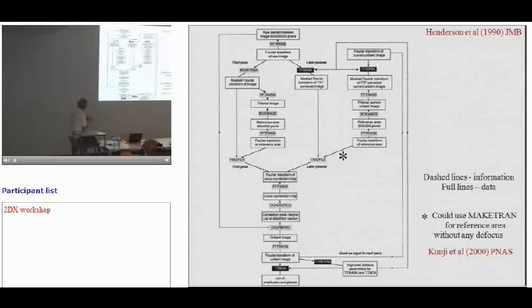And you can then plug that back in, and in later passes, you get much cleaner cross-correlation maps. You can unbend it again. In the second pass, then, you're doing almost as well as you can. And, of course, you can carry on doing this until you feel that there's no improvement. And I'll show you a little bit later about how we judge that improvement.